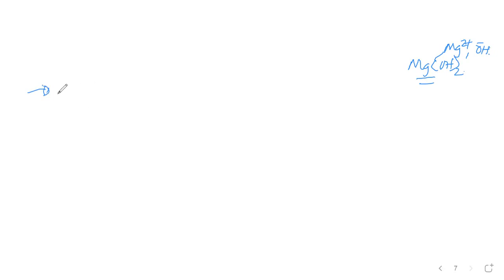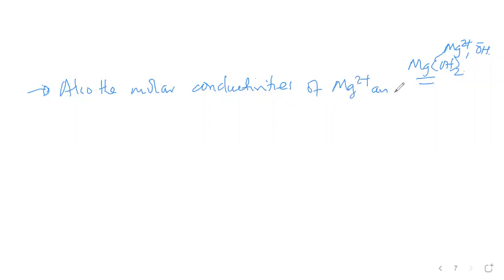So we also read the molar conductivities of magnesium ions and hydroxide ions from the tables. There are always books or data tables that have these values.